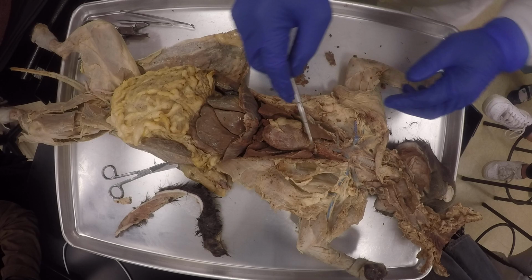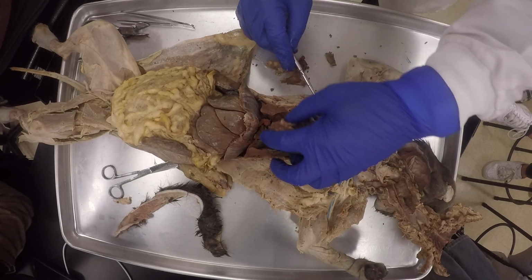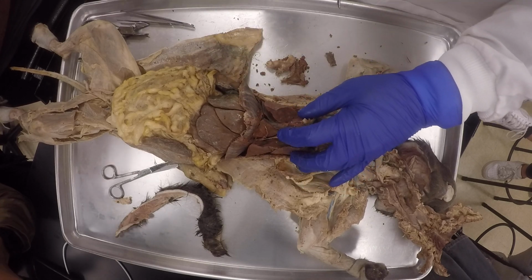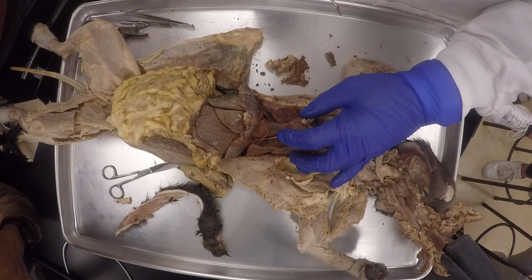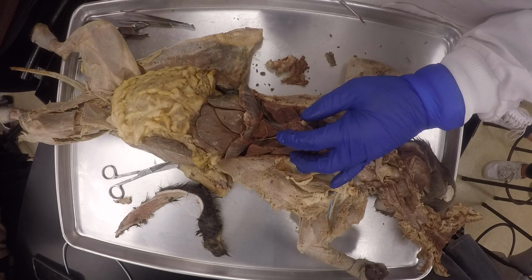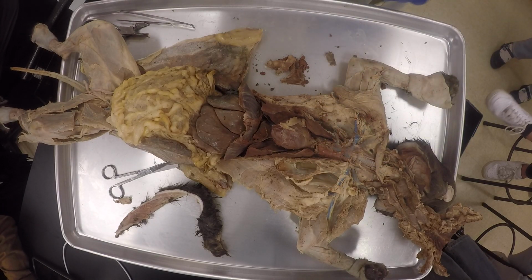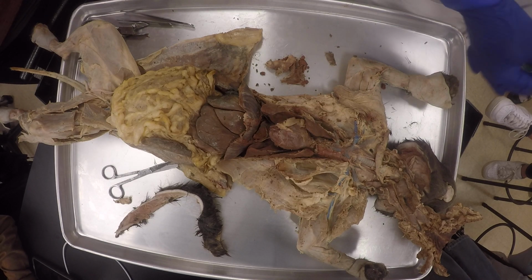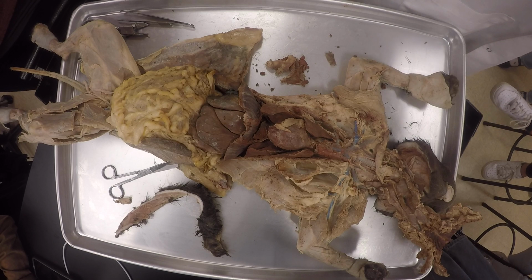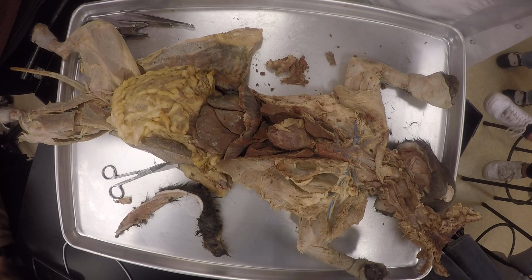Okay. And then the seventh and final lobe of the lung for the cat. The cat has 7 lobes in the lungs, and the human has only 5: 3 on the right, 2 on the left. The liver has 4 lobes in the human, but the cat has 5.